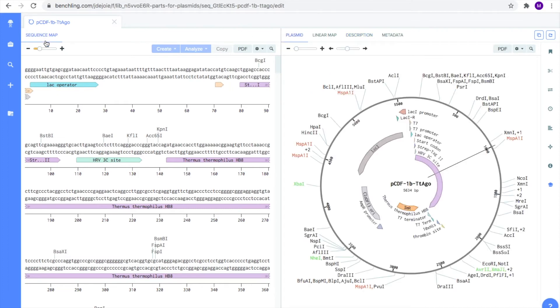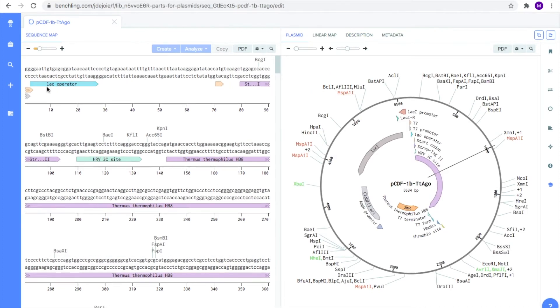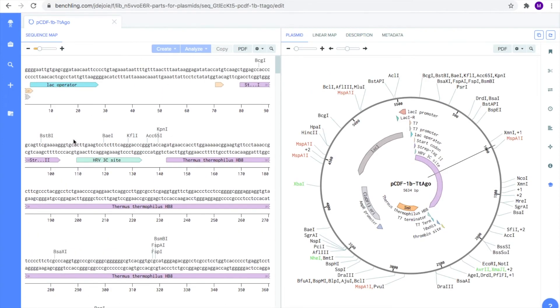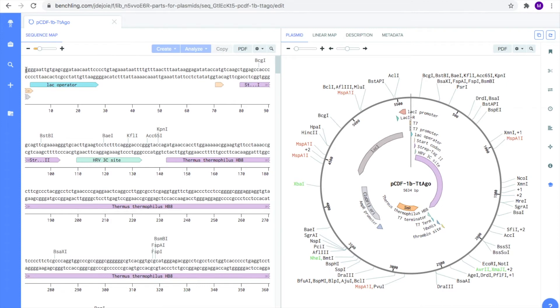Go ahead and click on the sequence map subtab. Earlier, you may have noticed these vertical gray lines on the sequence map and plasmid subtab. These gray vertical lines represent the different restriction sites, which Benchling automatically annotates for you when you upload your DNA sequence.